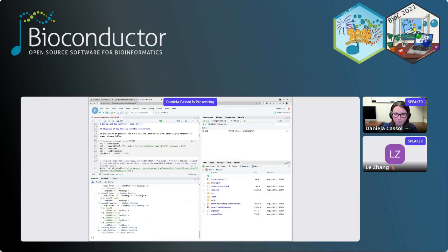Now we can take a closer look at this object, the sal object. A few things you can already start to look at are the step names. We have load workflow, which is the load libraries, sorry. Then the trimming. I forgot to mention, this will be a very, very simple RNA-seq workflow on toy data. Here we have the trimming of that data, and we'll use Trimmomatic to do that. The next step is the index, to build the index with HISAT2. And then we have the mapping, and then we are calculating some mapping statistics down here in step number 5, and calculating the read counting for each one of those samples, and then the session info down there.